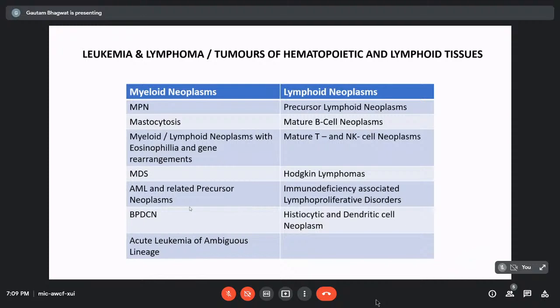As we are talking about lymphomas, which basically come from the lymph nodes, if the disease is not present in the peripheral blood or bone marrow, then it becomes difficult to make a diagnosis on flow cytometry, and in such situations immunophenotyping by IHC is a better option.